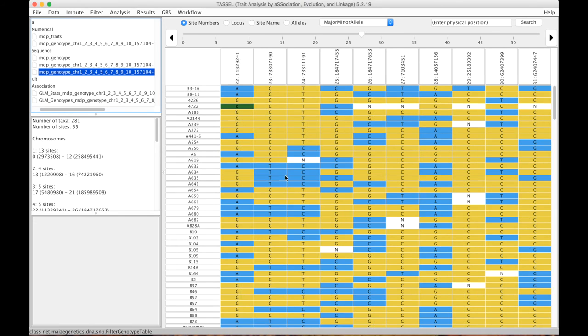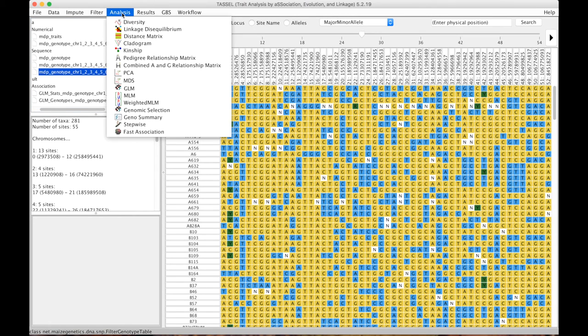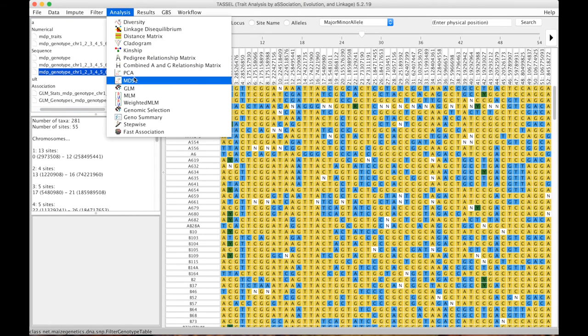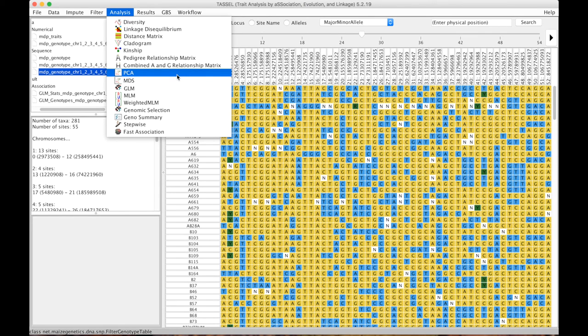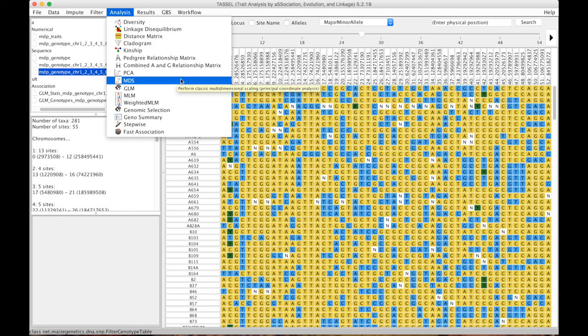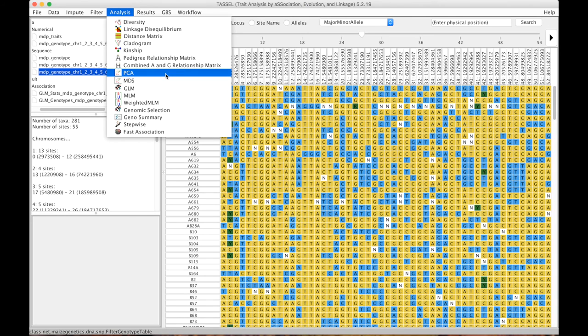Okay, now we have that. So we have 55 sites for all these taxa. Now what we can do is we can do two things. We can either do principal component analysis or multi-dimensional scaling. They're very closely related and in the absence of missing data they are essentially the same. If you have lots of missing data I normally would go for multi-dimensional scaling which normally first does a distance matrix and then does the decomposition based on that distance matrix. PCA will go directly at the genotypic data.